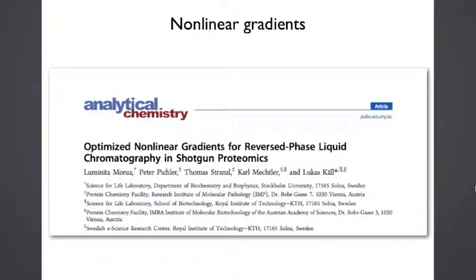But first of all, before watching this video, I would strongly encourage you to read our article published in Analytical Chemistry, where you can learn more about the use of nonlinear gradients, the advantages of using such nonlinear gradients, and the different types of gradients that you can calculate. So please read this article before proceeding with this video.